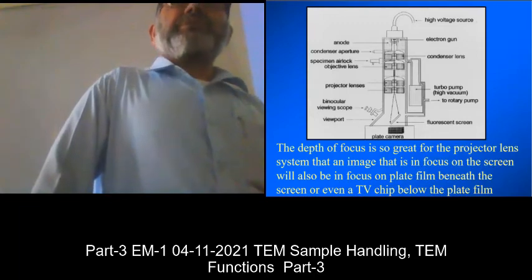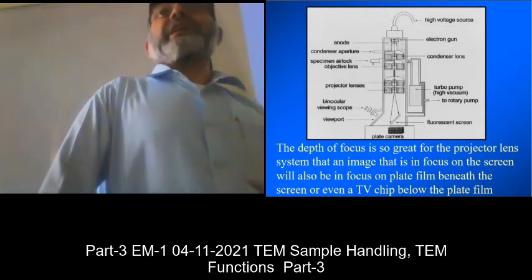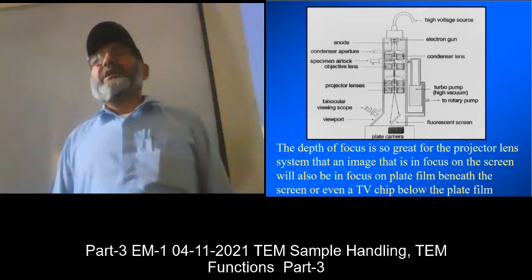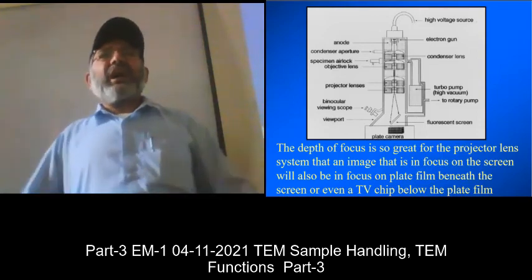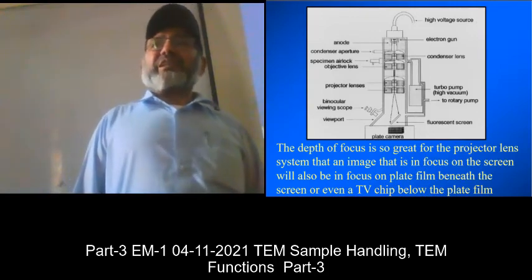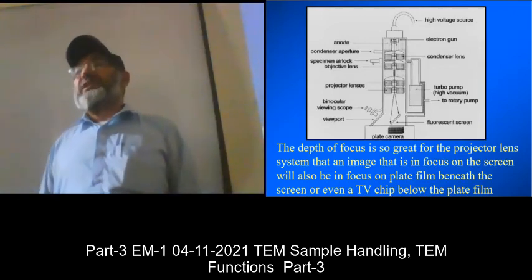In the old days, people didn't like computer generated things, but the camera which is used in the transmission electron microscope is a very highly sophisticated camera. So it is not harming any information or losing any information when you are taking images on that. And an important thing is how much resolution the camera has.